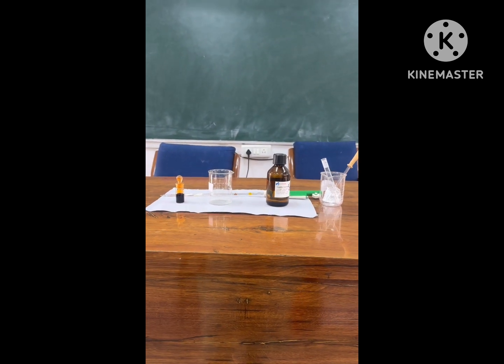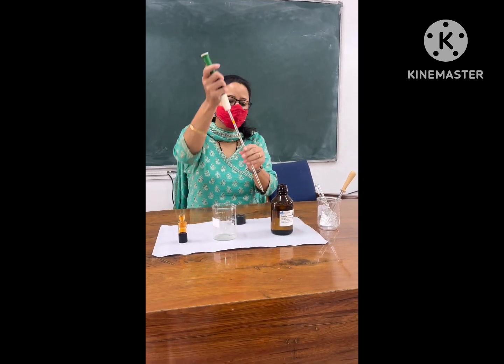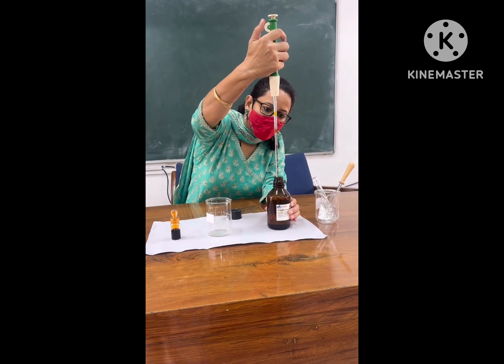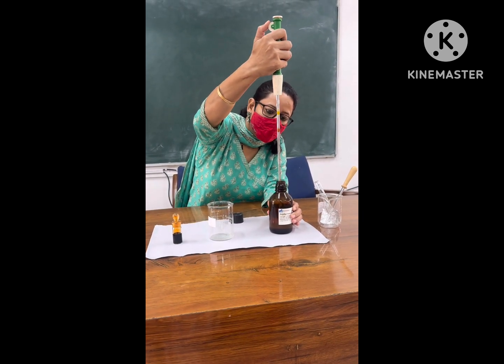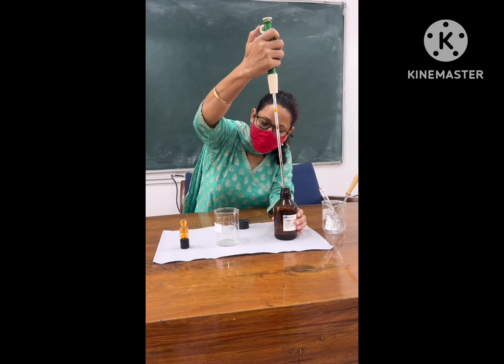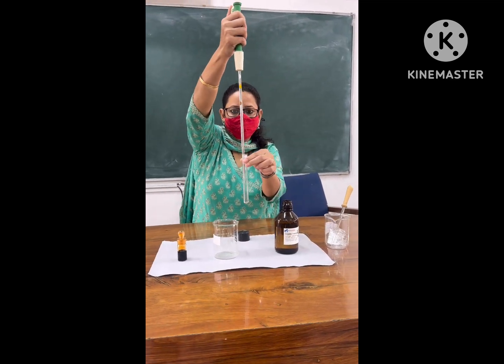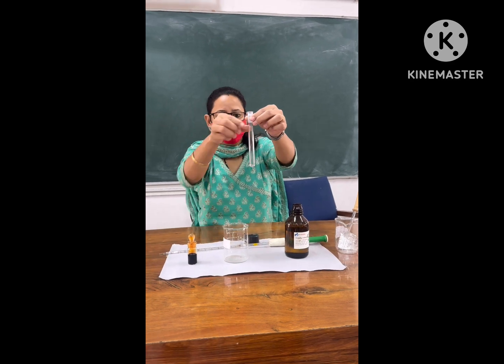Here I have taken 0.5 ml of dimethyl maleate using a pipette, and this dimethyl maleate is poured into a test tube. 0.5 ml of dimethyl maleate is poured into a test tube.